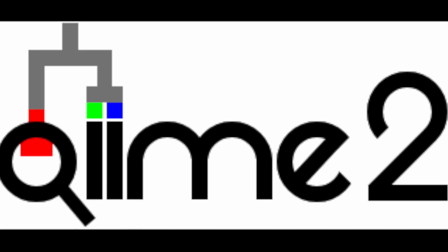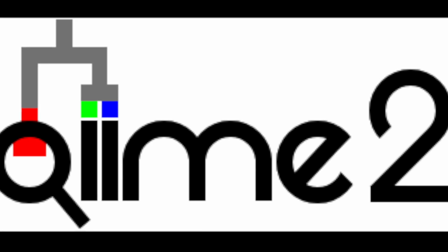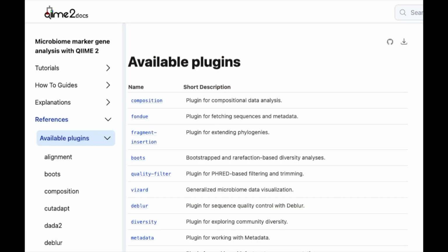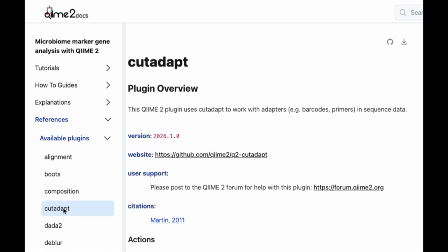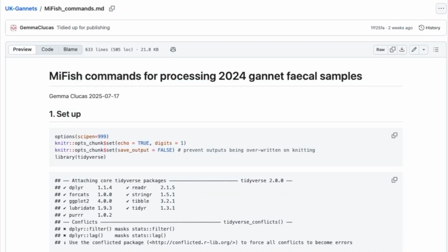Now, QIIME was originally developed for microbiome studies, but it's just as flexible for any sort of metabarcoding analysis. And I really like it because it includes a lot of different plugins that you can use. So one that we use often is Cutadapt, also DADA2, and you can run these individually, but running them inside QIIME is really straightforward, and so that's why I use QIIME for all of my analysis.